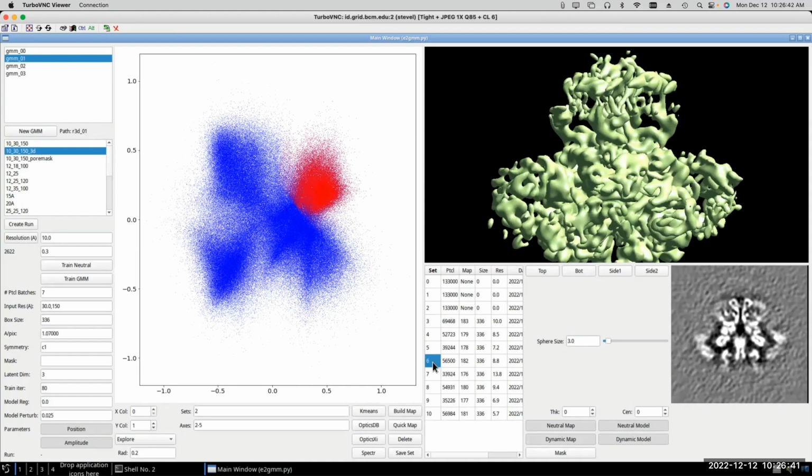Anyway, I don't have answers to a lot of questions yet. One of the things that we need to do is have some better strategies for doing some dimensional reduction to try and better visualize some of these subspaces. If it's a three-dimensional space, it's fine. We can do visualization of three-dimensional points pretty easily. But if it's a higher dimensional subspace than that, then without dimensional reduction, it's kind of tricky to really see. What you're seeing is actually a projection.